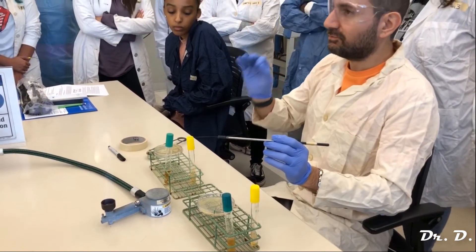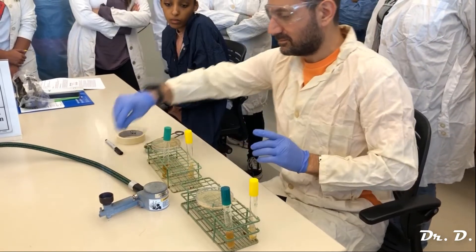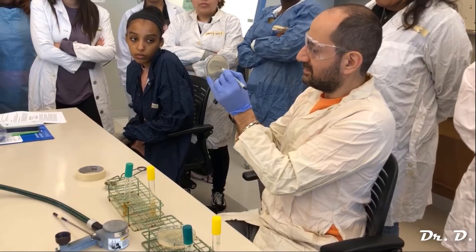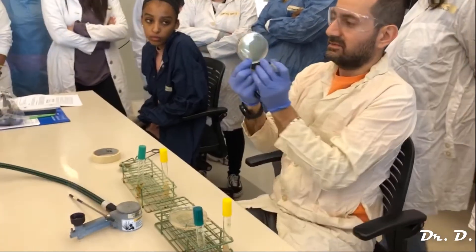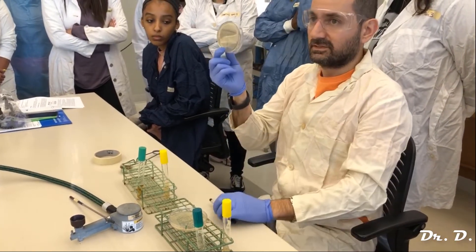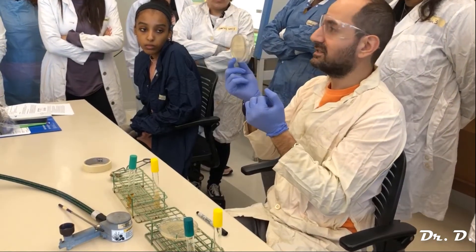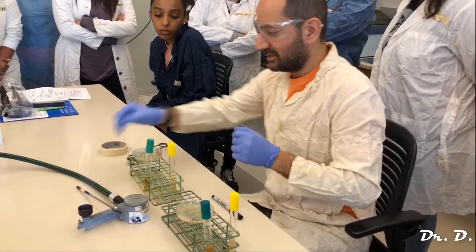How do you make a streak plate? A streak plate gives you isolated colonies. The best way is: you've got your plate, and you want to have three zones. On the bottom side of the plate you can draw a line and then another line, kind of like a T. The biggest zone is zone one, and then you have zone two and zone three. You start with zone one — make a line and then go across that line repeatedly. That's where most of your bacteria will be, but you won't get single colonies there.